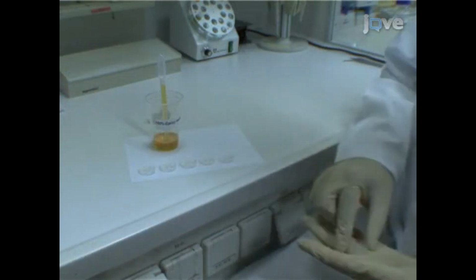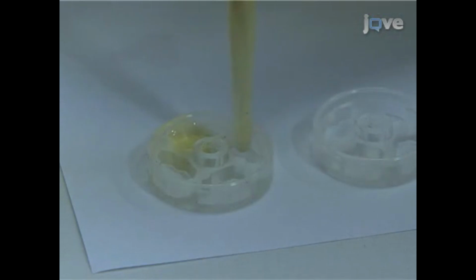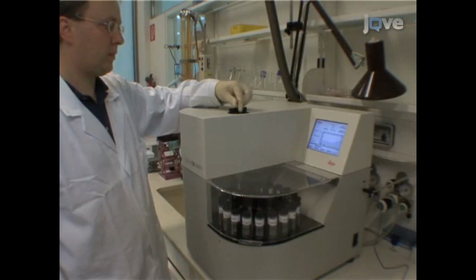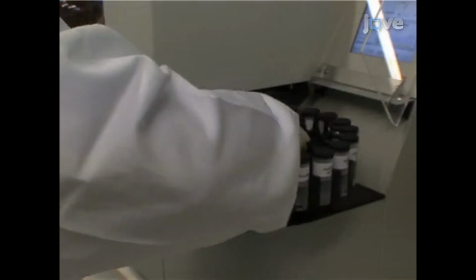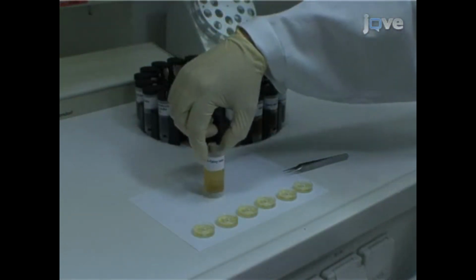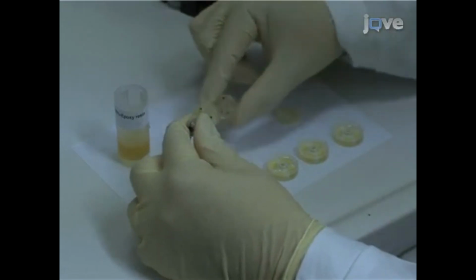Just before the sample preparation protocol comes to an end, fill freshly prepared agar 100 epoxy resin into the designated polymerization forms. After the protocol is finished, release the stacked baskets containing the infiltrated samples from the monomode chamber into the last vial of the carousel. Remove the carousel from the microwave device and take the vial containing the samples from the carousel. Then, remove the baskets from the vial and unstack them.